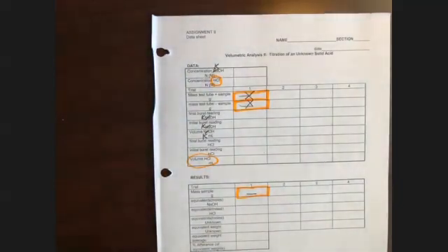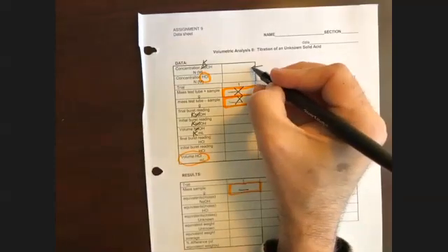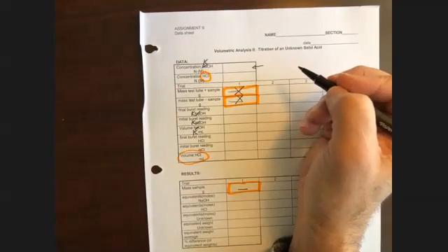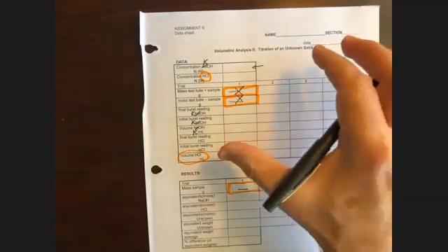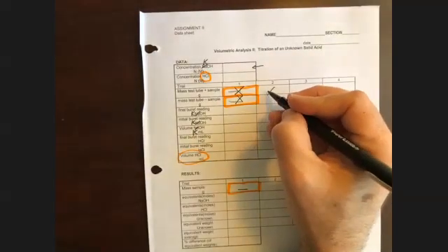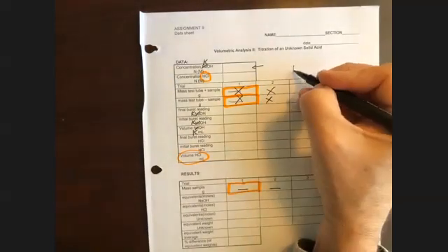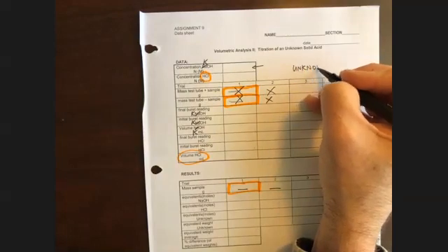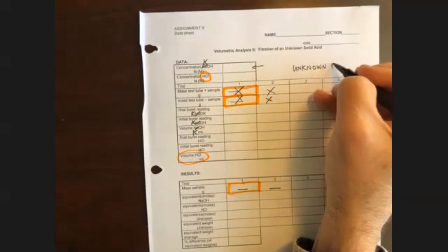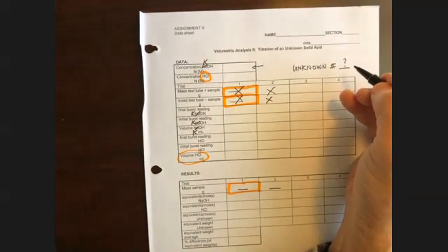Because we are not going to be able to actually use the KOH that we made in our lab, what's going to happen is you're going to receive a data sheet that looks like this. It's going to have, of course, nothing here, nothing there, but it's going to have values for these different items here. It's going to have some kind of an unknown identifier. Okay, it'll be either a number, I don't know, 3, 5, 7, maybe a letter, A, B, C, something like that.